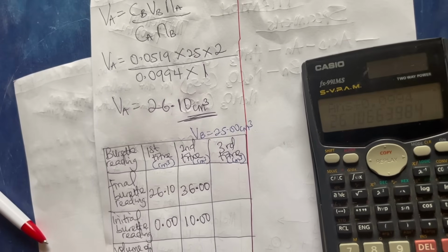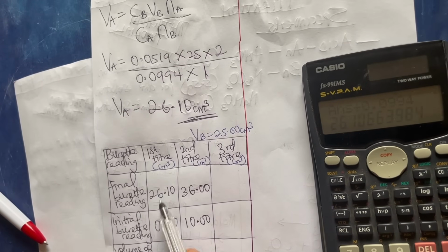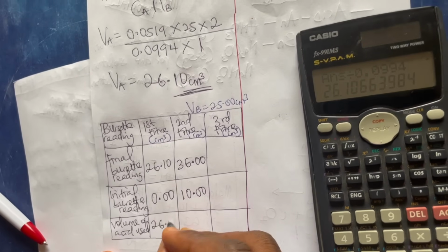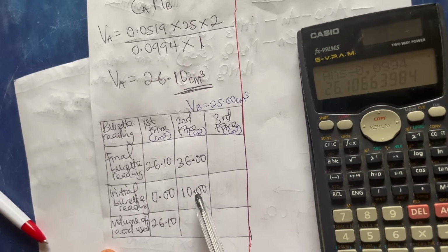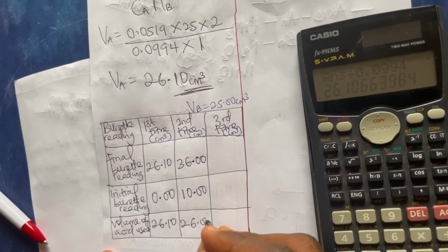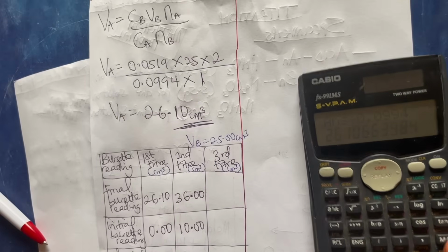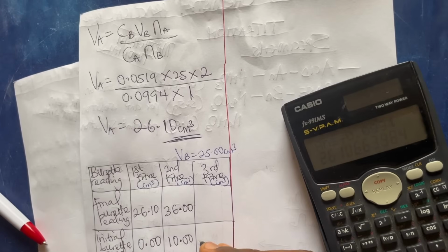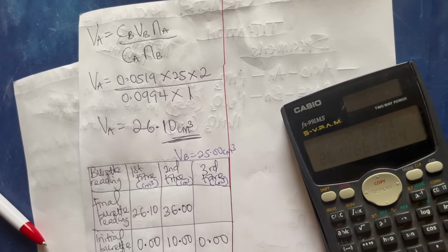So let me now make this one to be 36.00. If I subtract this from this, what would I get? I'm going to get 26.10. If I take away this from this, I'll get 26.00. Now I can make here also 0.00 as well.